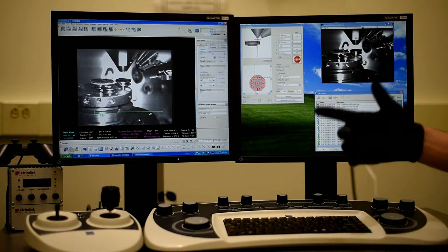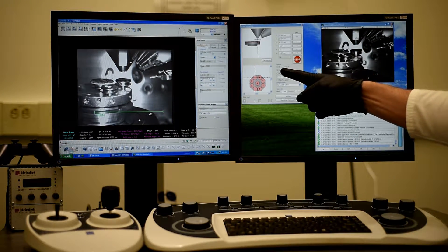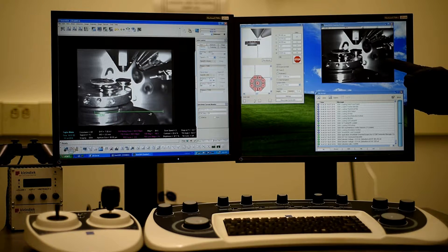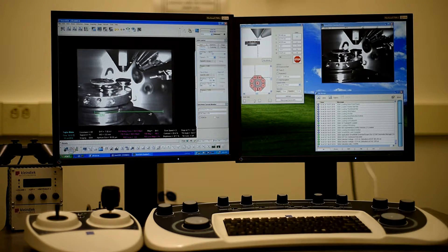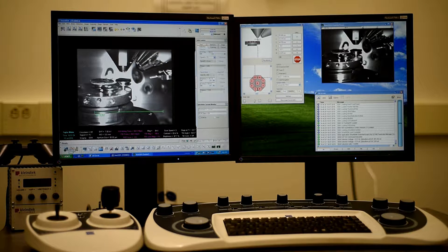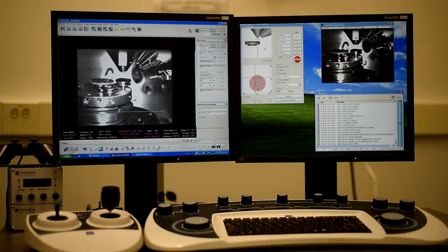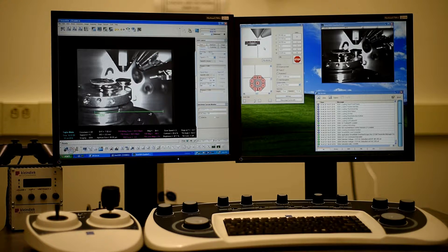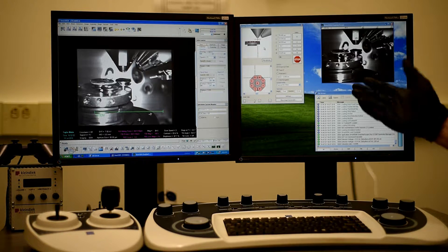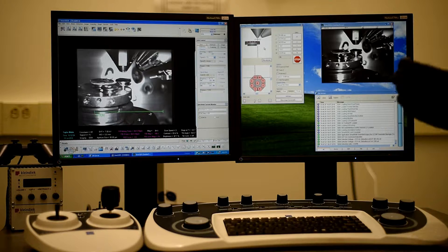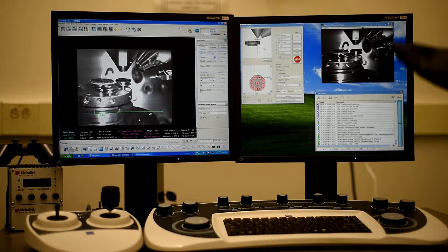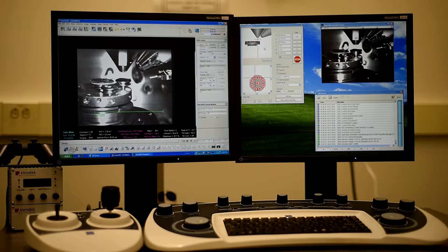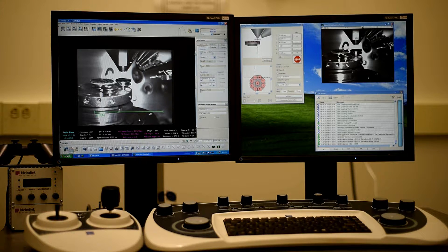There's three screens. There's our main screen, the stage navigation screen, and then the TV monitor. So if you look at the stage navigation screen, there's a blue line, which should be around 5 millimeter working distance. So typically, if you've got high pole pieces, we don't want to go above that. We do not want to crash the sample holder or our samples into the SEM.